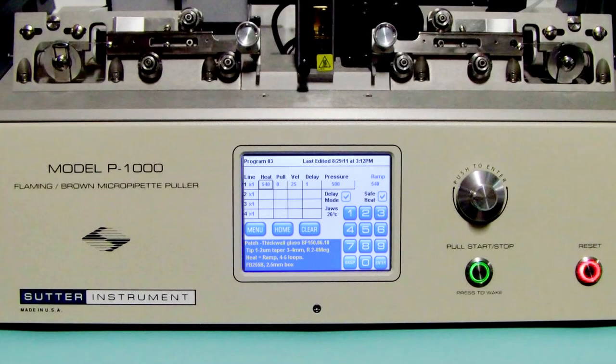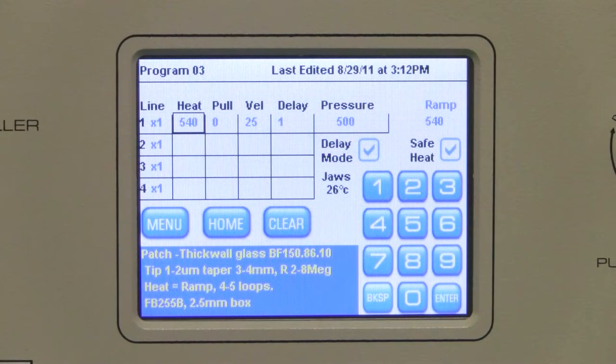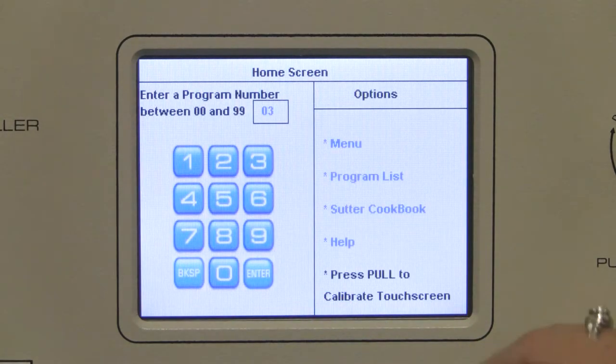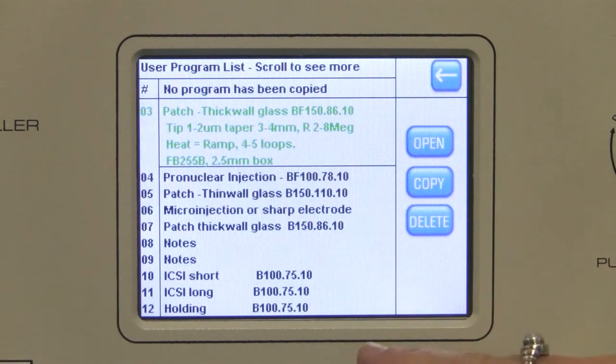In this example we will make a copy of program number 3 into program 71. On the P1000 puller, copying a program is started from the program list. So if you have a program open, press the home button and then select program list. The last program that was open is automatically highlighted — in our case that is program number 3, which is the one we want to copy.